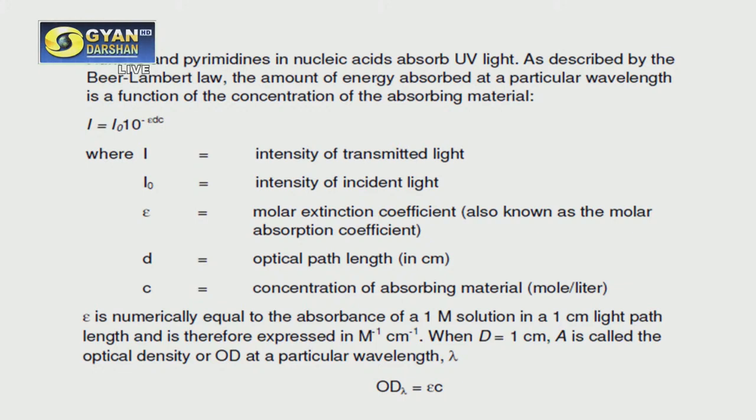Actually you just take the sample in the cuvette and place the cuvette in the spectrophotometer, and the spectrophotometer will give you a reading at 260 nanometer wavelength and 280 nanometer wavelength.